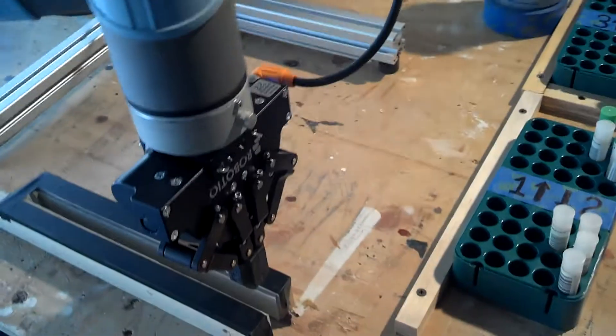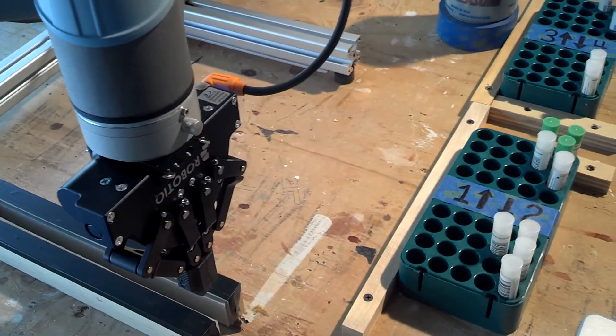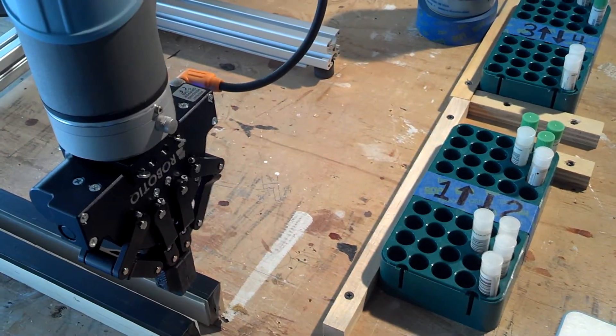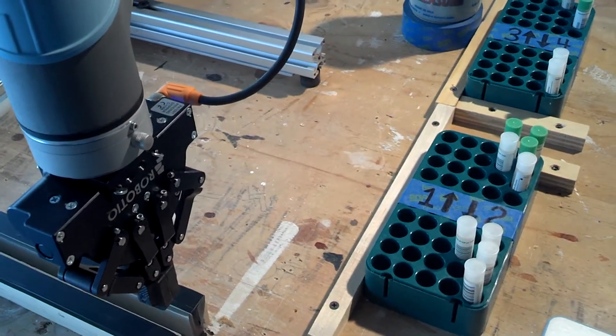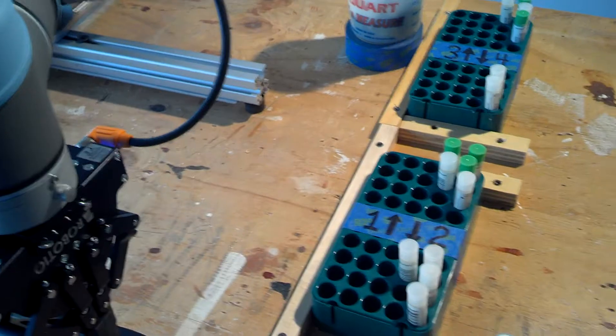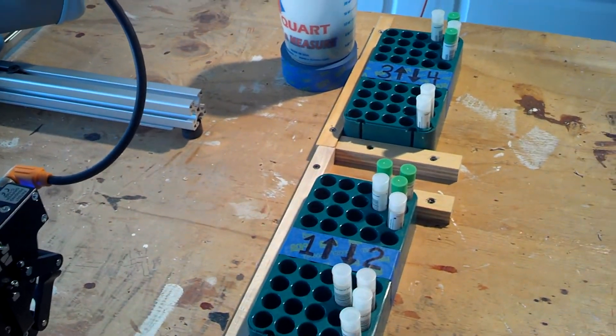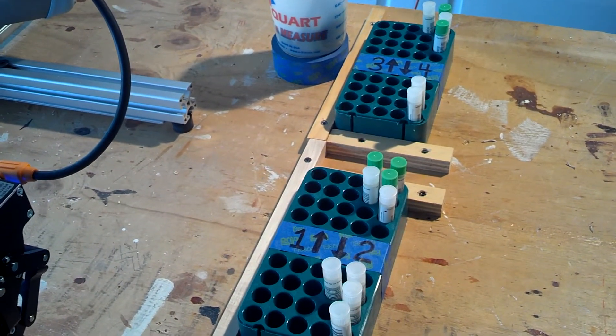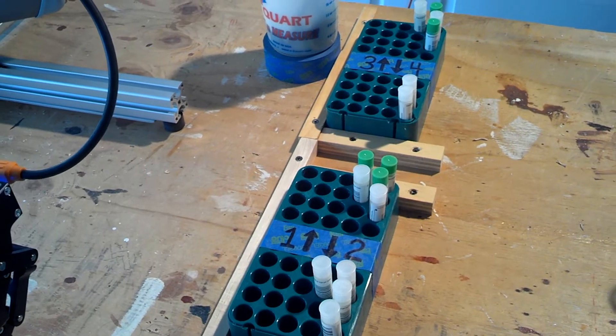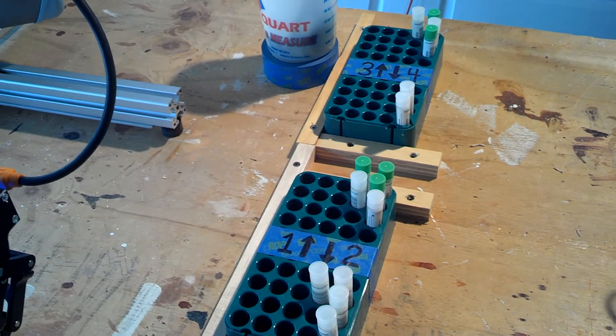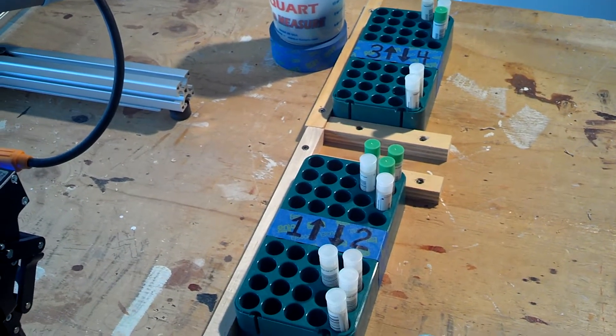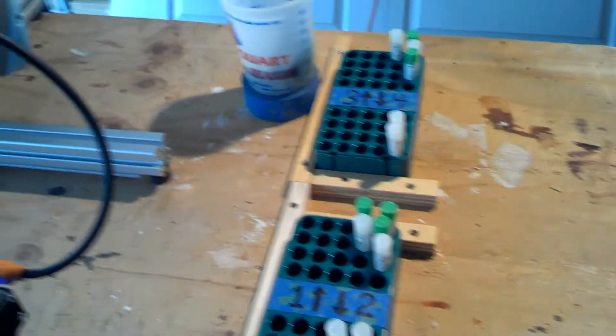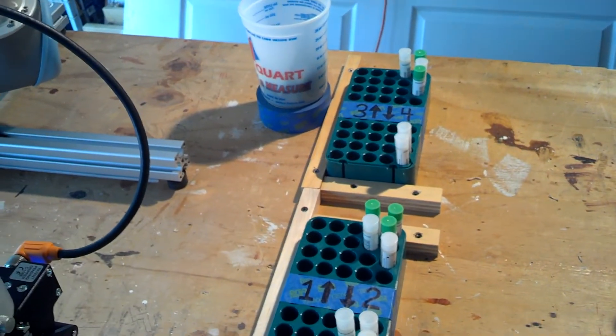So we can, as soon as we figure out how to read the barcodes and take it through a PLC or something like that, where depending on which barcode it read, it sends a digital signal to turn on an input on the robot. Then the robot can decide which pallet to put it in based on our program.